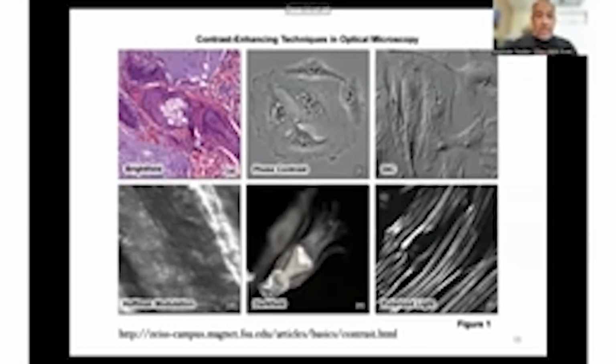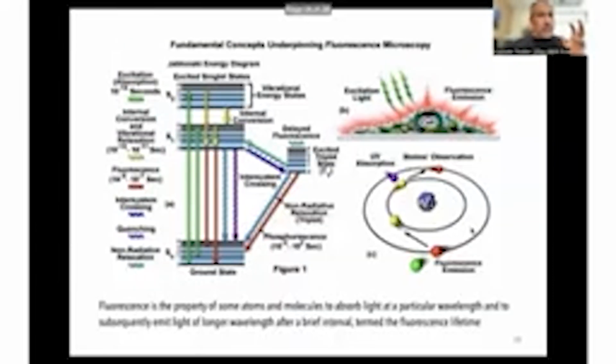Okay. There are many different kinds of microscopes, and this is just a way to give you a sense of what kind of light sources can be used to enhance the contrast and be able to see things that you otherwise may not be able to see, right? So even with light microscopes, there are variations here, right? Bright field, phase contrast, DIC, dark field, polarized light microscope, all essentially using light to illuminate the object slightly differently to allow you to be able to see things, right?